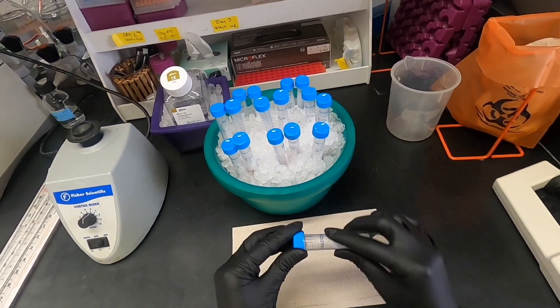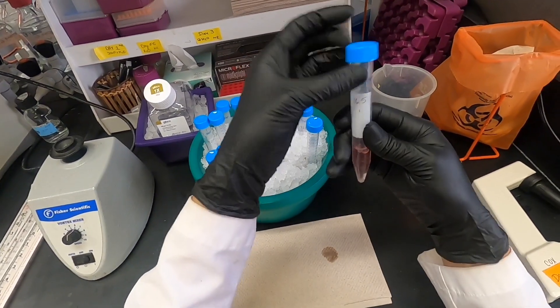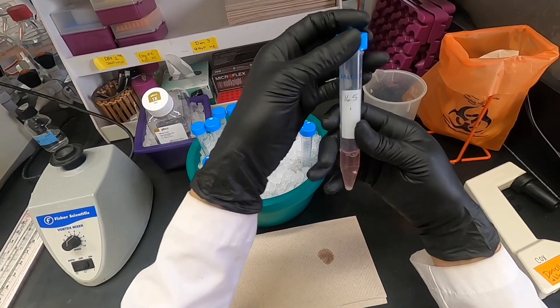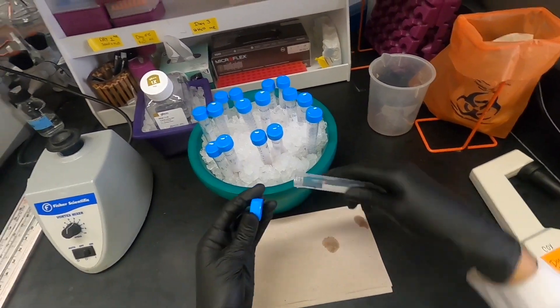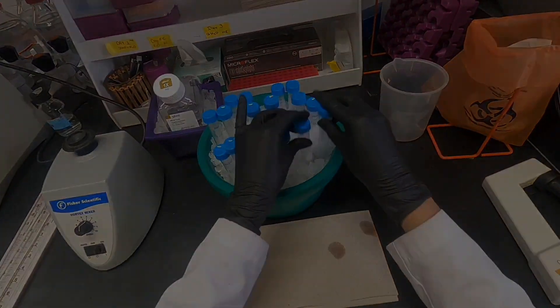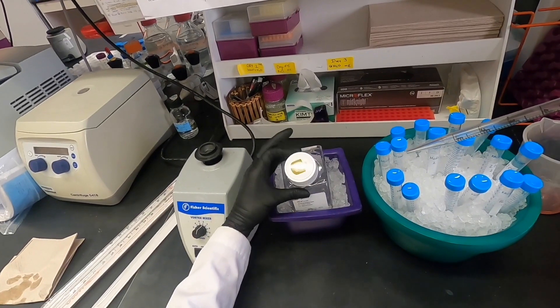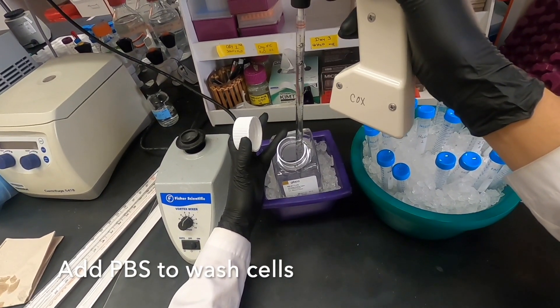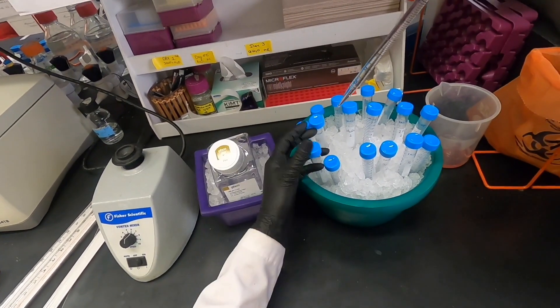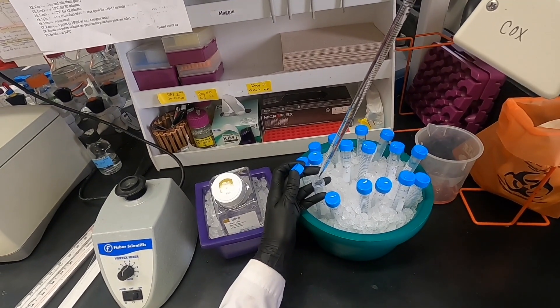This is easily done by inverting the tube over a waste container in order to decant the supernatant. The cell pellet will remain intact as long as the tube is handled with care. The cells will then be washed using cold PBS. The purpose of this is to remove the excess media and FBS.